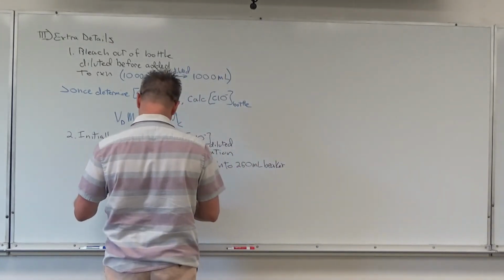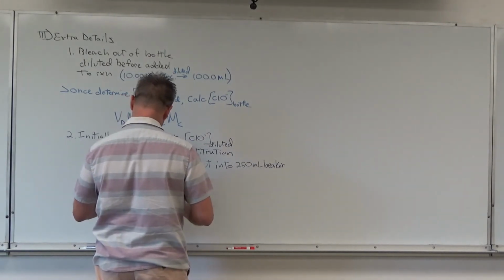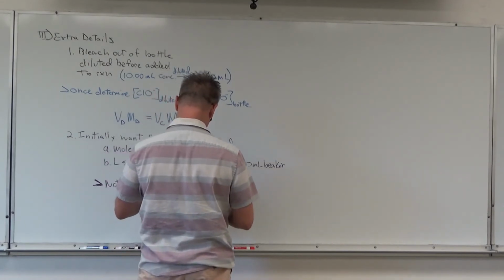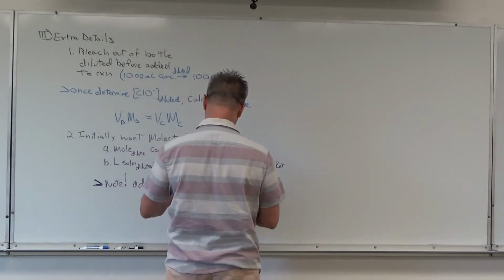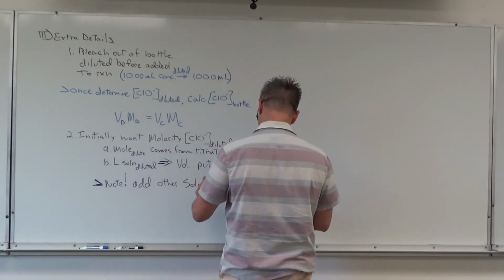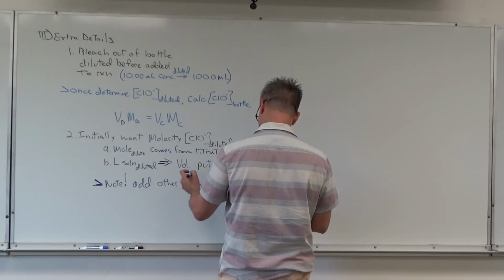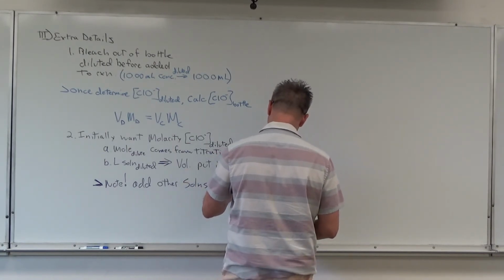Put that note down there. Note: add other solutions to beaker.